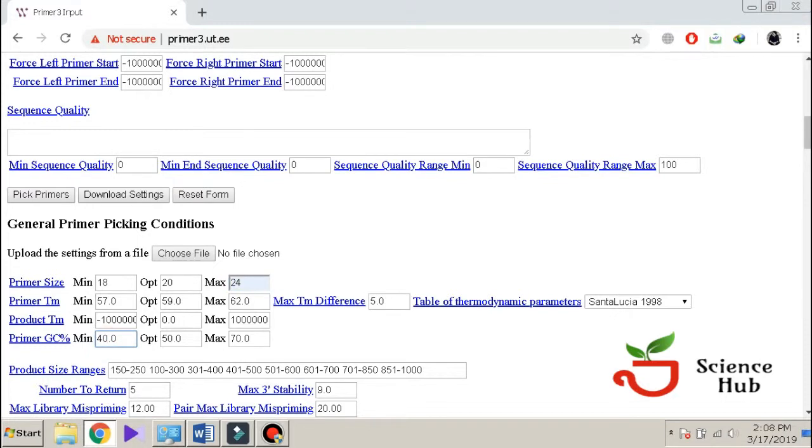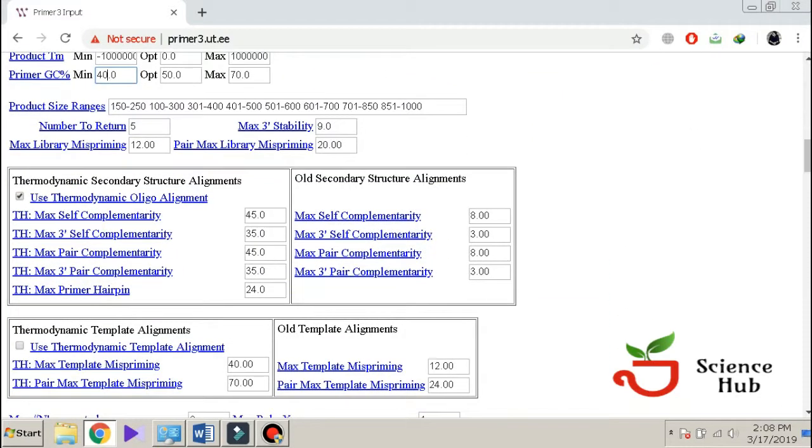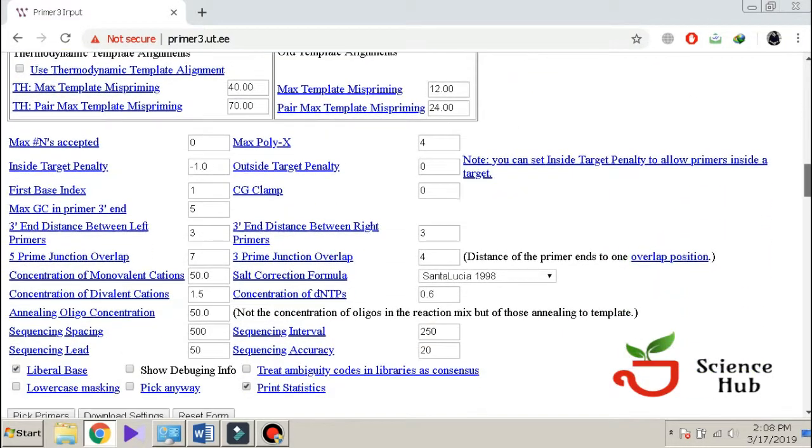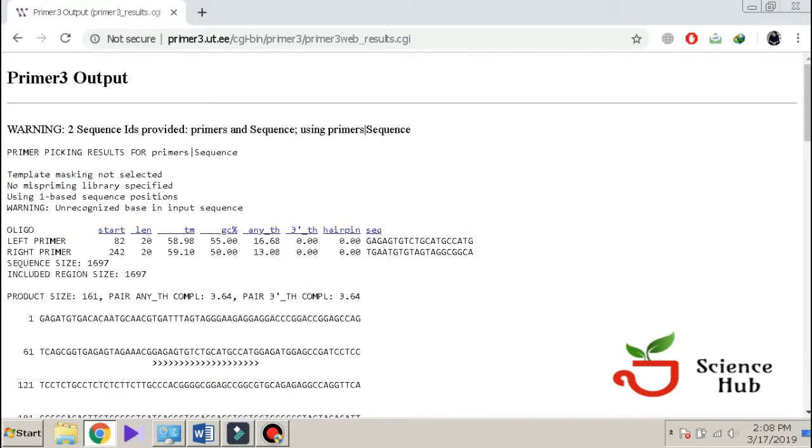Now we will go for the option pick primers. Here it is, pick primers. And now it is loading. The work is done.